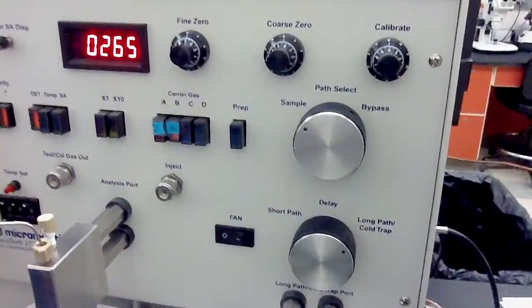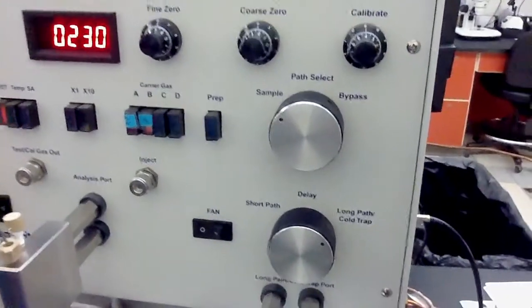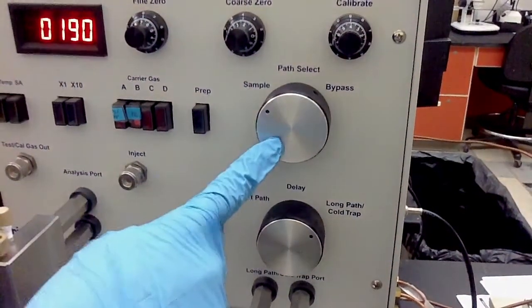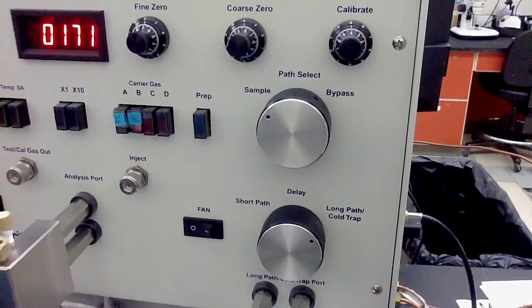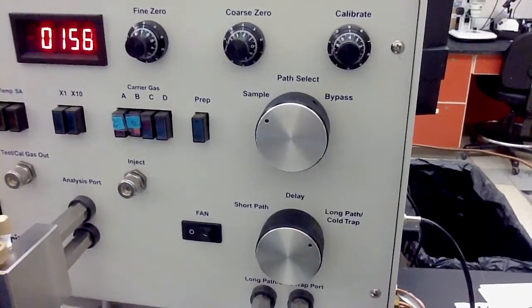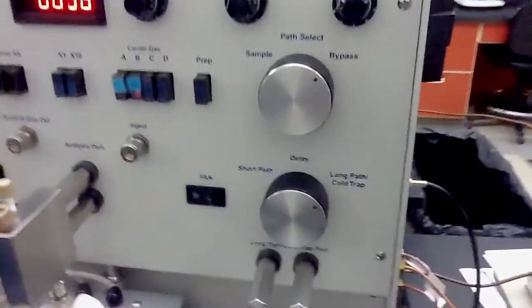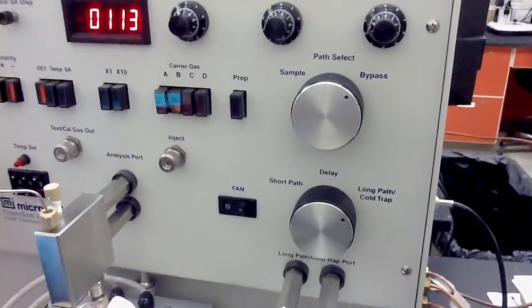In the meantime, we also want to prepare our sample. If we take out the sample tube, the gas will not flow through the TCD. But there is an option, which is this valve. We can turn this to sample or bypass. If we do bypass, the gas will flow through the bypass tube, so we don't need the sample tube there. So this is bypass. Now gas is going through the bypass line without going through the tube.